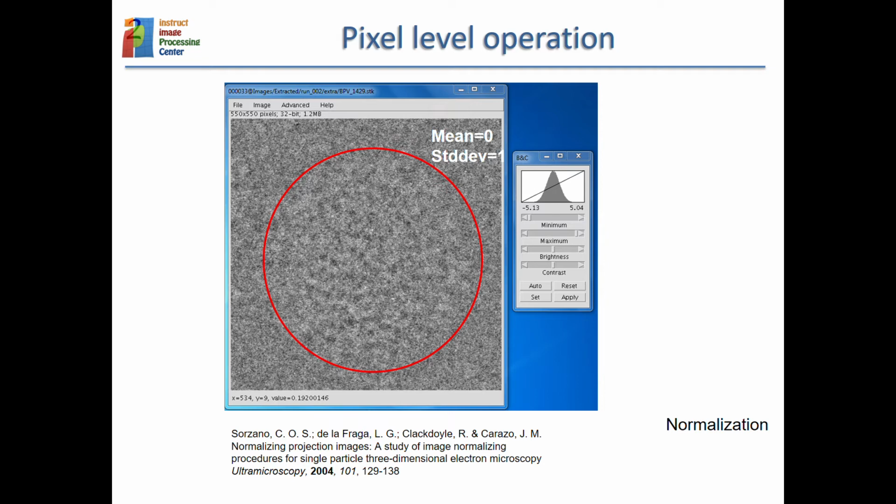But when you come to 3D reconstruction, which, as we already mentioned, is kind of averaging, you have to make sure that all the numbers you are putting into the process are in a common numerical framework. They cannot be numbers between 0 and 1, and numbers between 0 and 2, and then you compute the average between those, because they are supposed to represent the same kind of molecules.